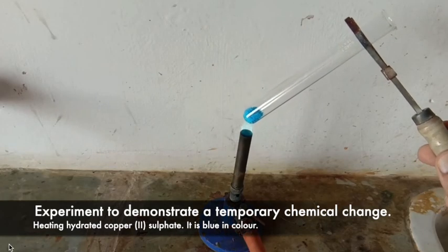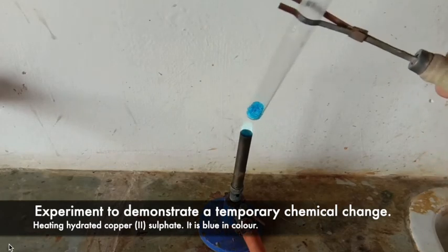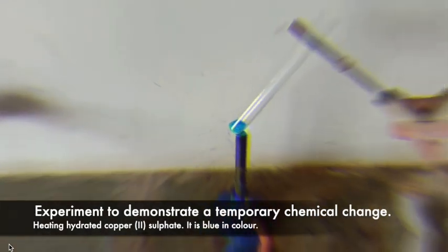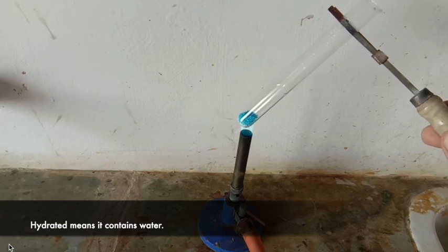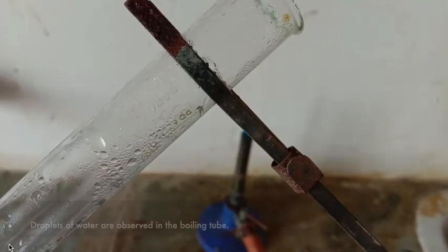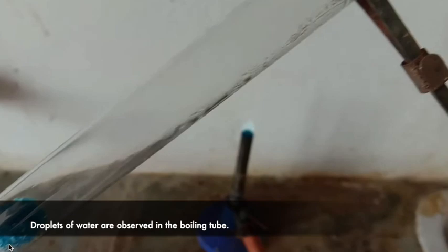Let's carry out a simple experiment to demonstrate a temporary chemical change. We will heat hydrated copper sulfate. It is blue in color. Hydrated means that it contains water. Droplets of water are observed in the cooler parts of the boiling tube.